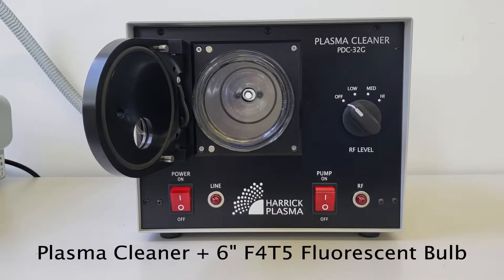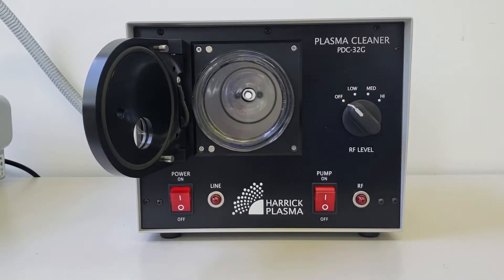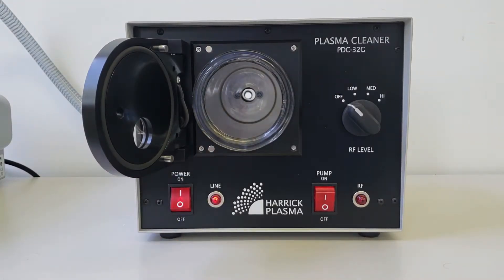You will need an installed plasma cleaner and a 6 inch F4T5 fluorescent light bulb. To conduct the bulb test, there is no need to evacuate the chamber. Turn on the main power and wait 10-15 seconds.